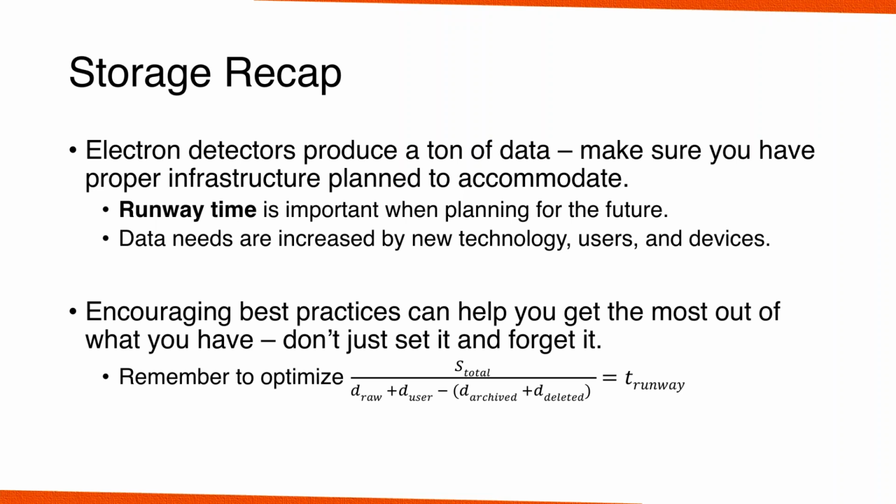And that data needs are going to be increased over time as well by new technology, more users, and more devices. Right? At any point in time, depending on your facility, someone could come in and say, oh, hey, I want to put this new detector here, or we got another microscope, or we got 20 more users, that kind of thing. You need to always be ready for that. And also, the second real takeaway here is that encouraging the best practices can help you get the most out of what you have. Don't just set it and forget it. Have someone take an active role in managing and passing through the data.